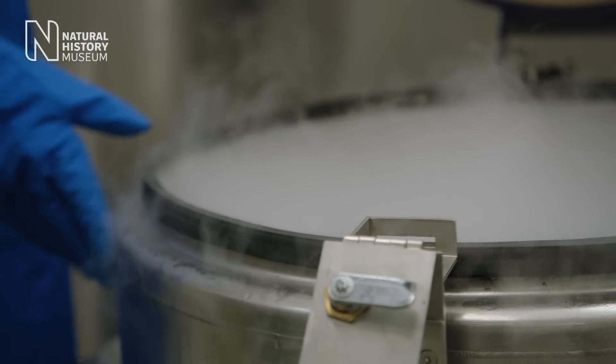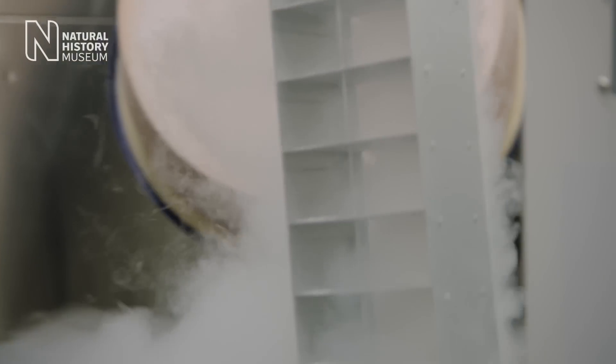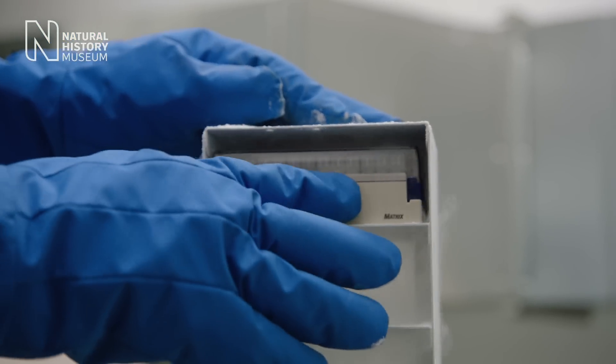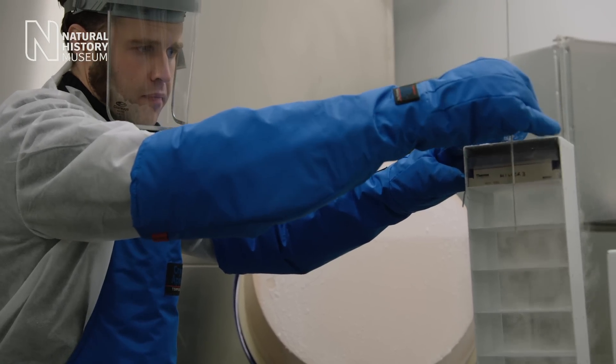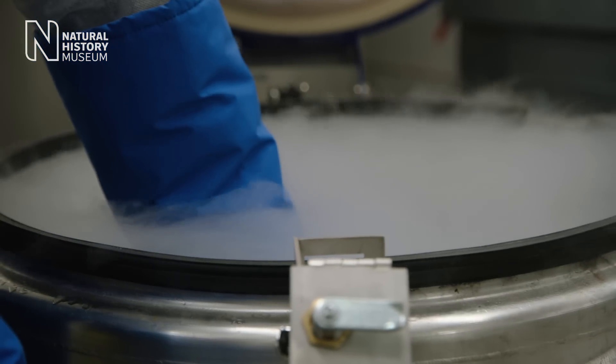But the story doesn't end there. What's also really important about the study is that we are collecting samples that we want to preserve for the future. These DNA samples that the students collected will be stored in our molecular collection and kept forever for future research and new questions in science.